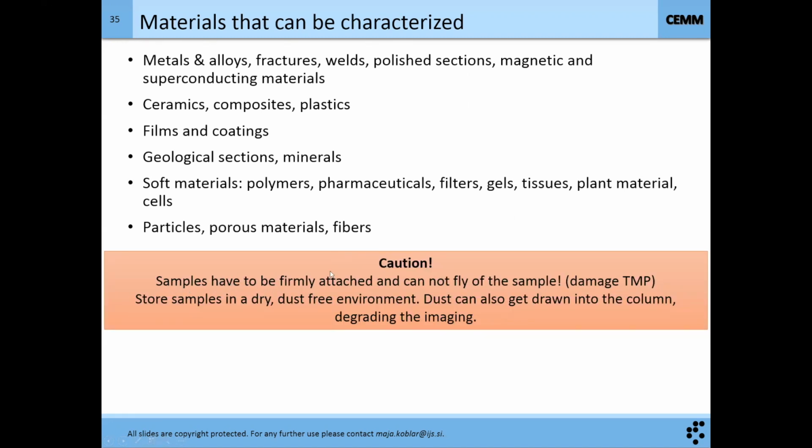Your samples have to be firmly attached, because they cannot fly out of the holder. You can damage the turbopump or the inside of the SEM. So the samples need to be stored in a dry, dust-free environment, so you also don't degrade the image.